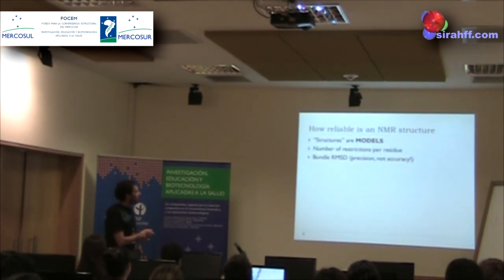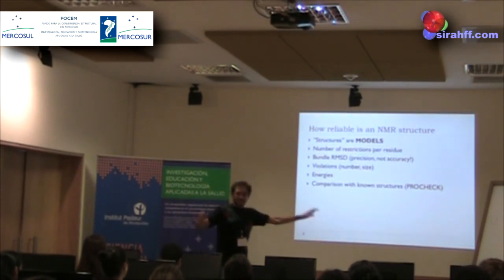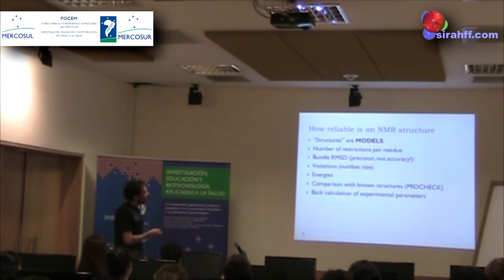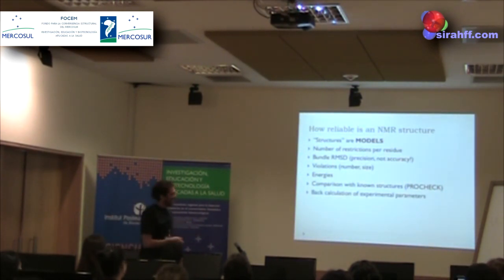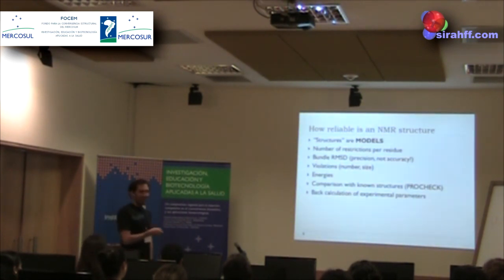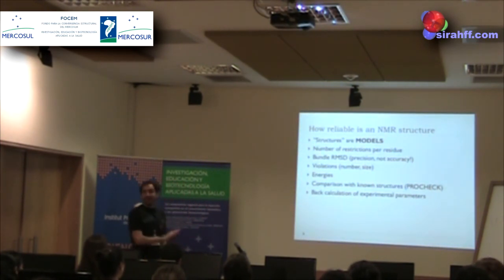So, the question is, how reliable is an NMR structure? Otherwise I will get killed by my colleagues. So, that is a bit embarrassing. NMR structures are not facts, they are models. They are models that comply or not, that can fit a very large data set. They are reliable models, but they are models. You don't have to forget that, right?